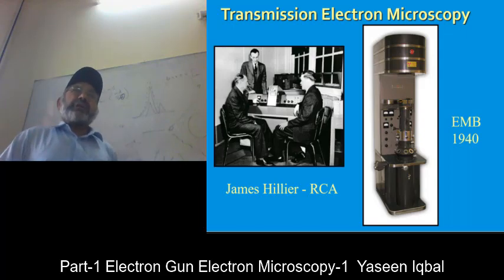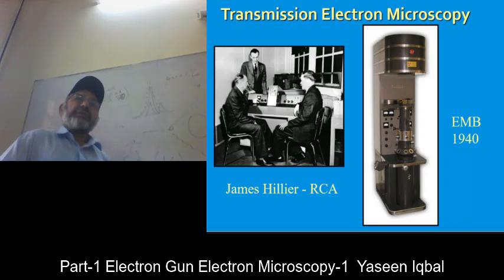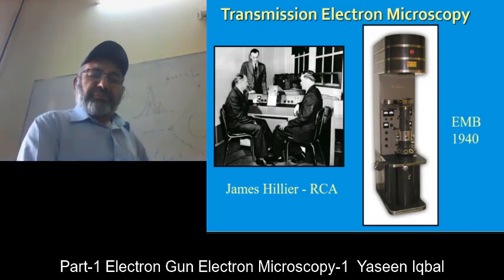And as we have in optical microscopy, the transmission and the reflection modes, the transmission concept was much more popular in those days, and probably because of that, people focused upon the transmission.